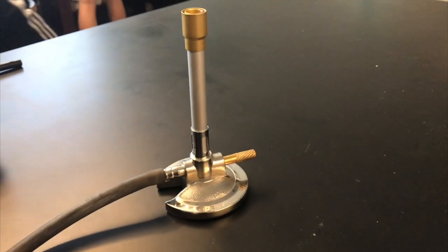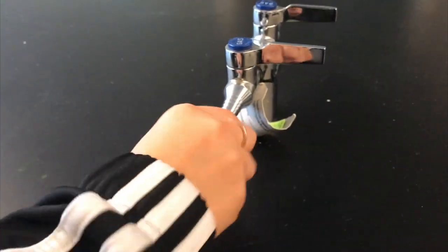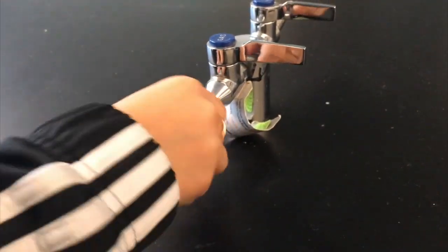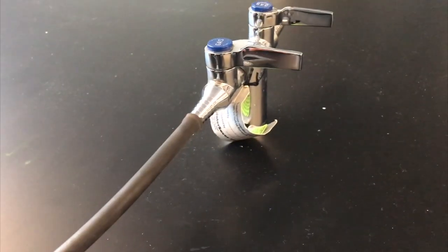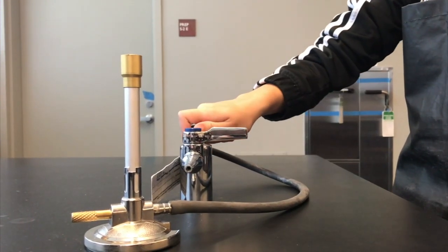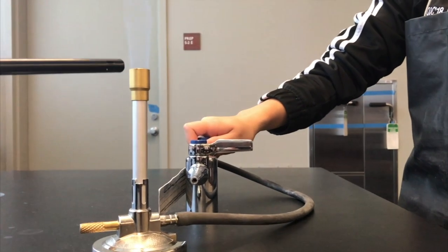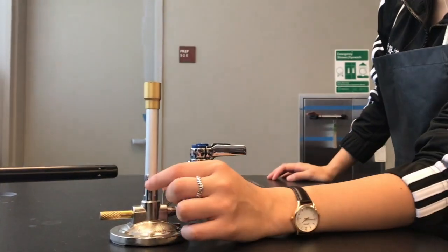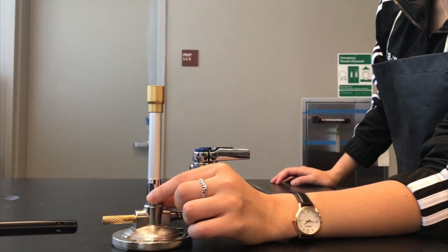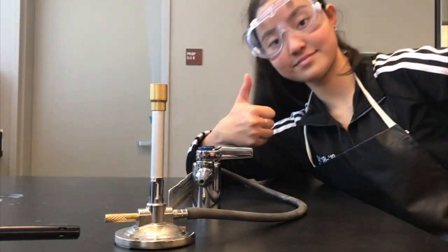To set up a Bunsen burner, connect the rubber hose to the end of the gas inlet. Then, turn the gas valve to the right at a 45-degree angle. Simultaneously, light the lighter over the top of the Bunsen burner. This allows the flame to appear. Next, slowly open the air hole until the flame is a cool blue color. This is the desired non-luminous flame.